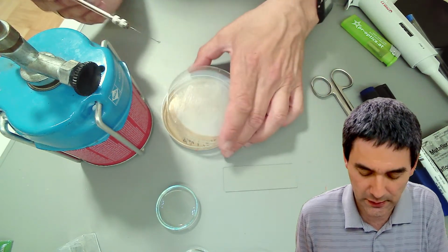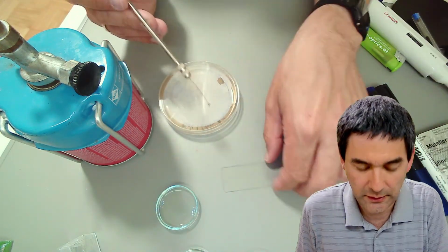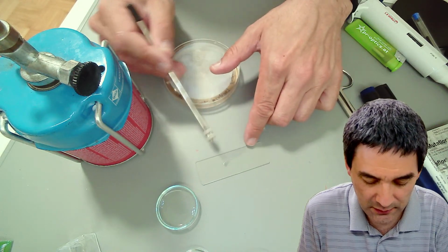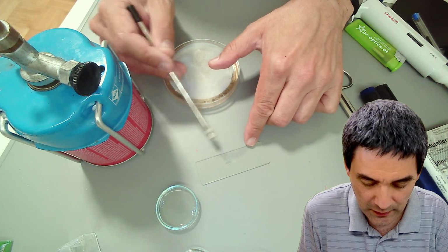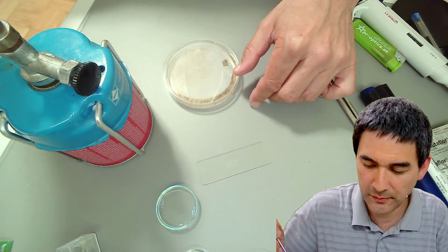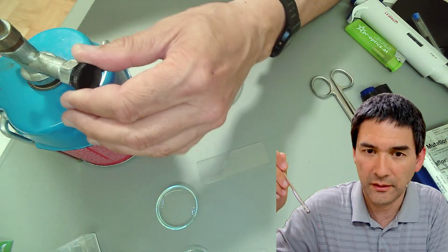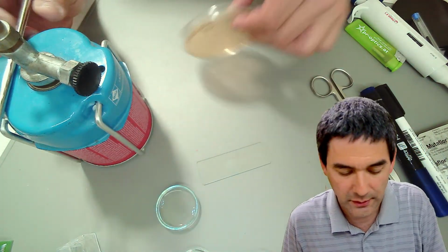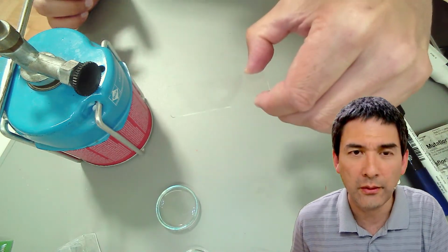Okay, I see that there is something on here. And I'm just going to suspend it on here. I'm going to glow it again. Okay. Turn off the fire. And then what do I do now?